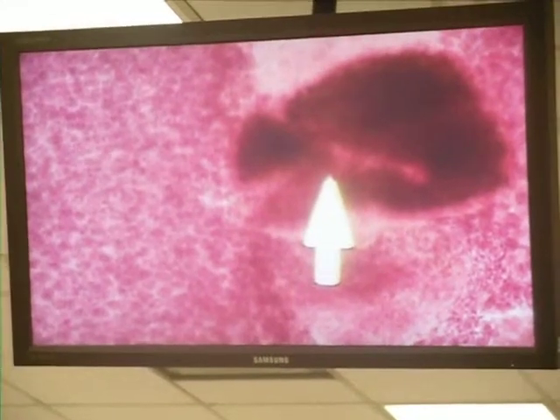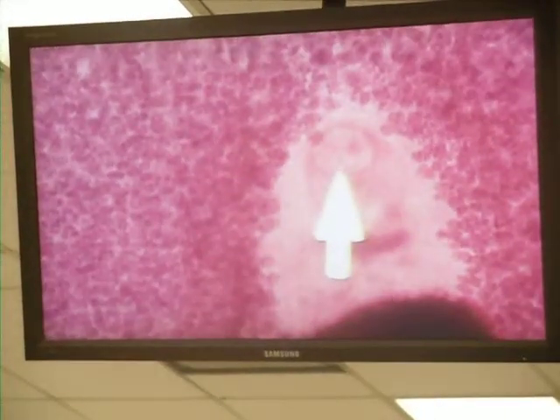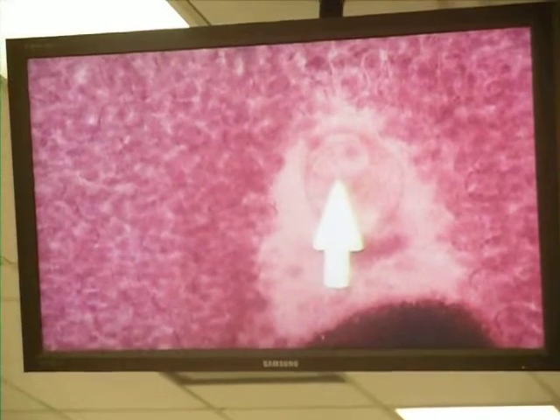So where is the pore? Well, the common genital pore is right here in the middle, right anterior to this uterus. The uterus, remember, is what tells us it's a coiled uterus. So the genus name is what? Spirometra, which means coiled uterus.